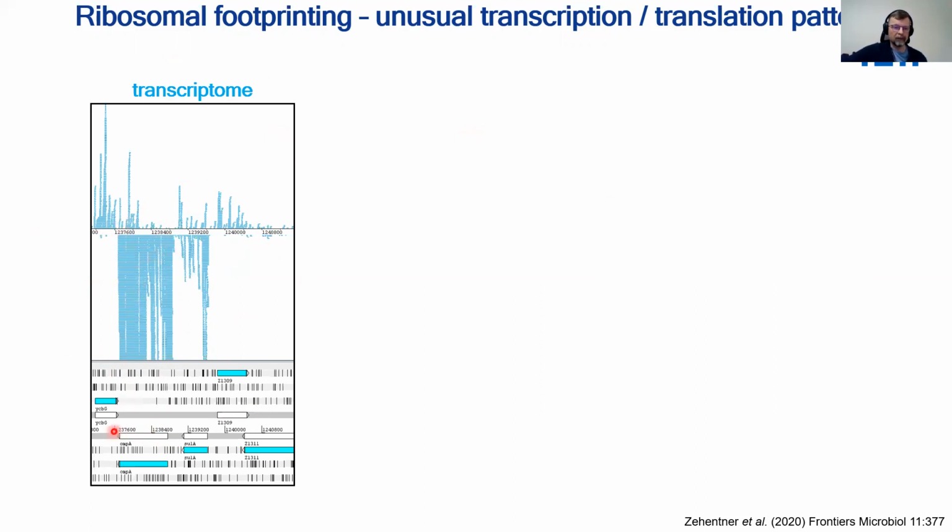And here for this gene, funny enough, you see reads also on this side of the genome, right? So there is some RNA produced, and normally people would assume this is non-coding RNA, which may regulate the actual gene messenger RNA. So normally people assume non-coding RNA if it is not within a known open reading frame, right?